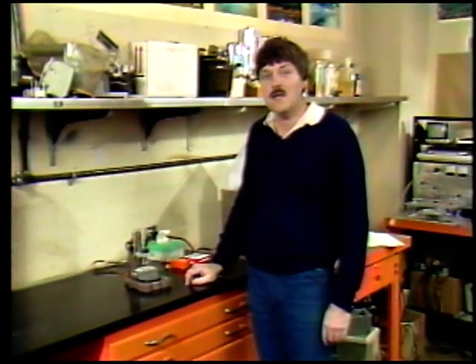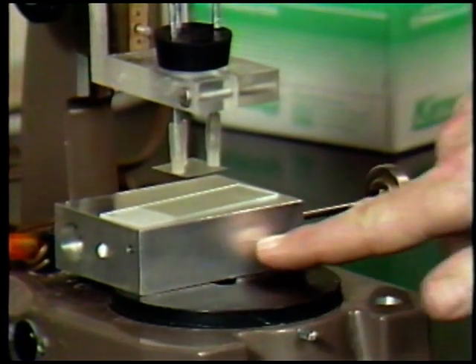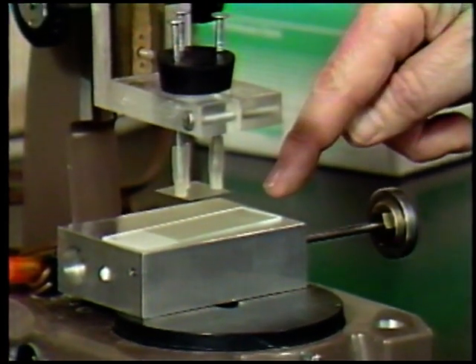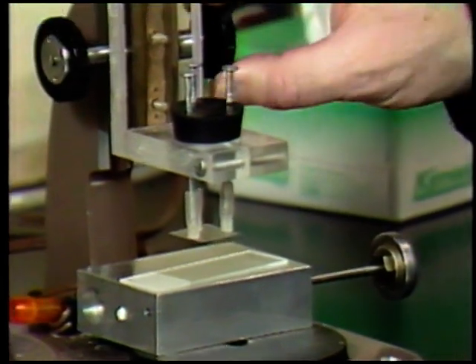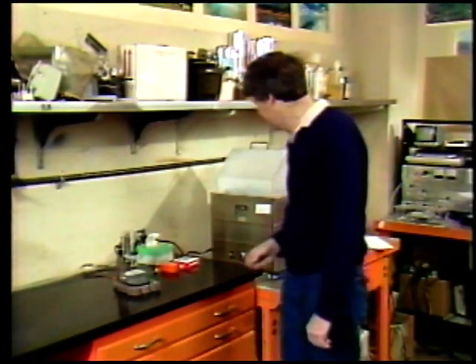My experiments began by creating an agarose gel on a microscope slide. This is a heated block of aluminum to heat this microscope slide, and this is a mechanism for raising and lowering a cover slip onto it.